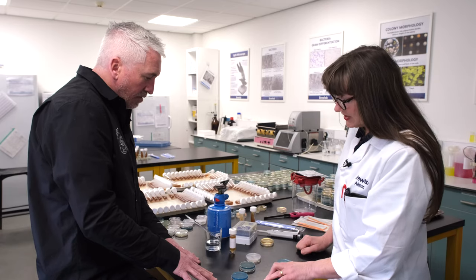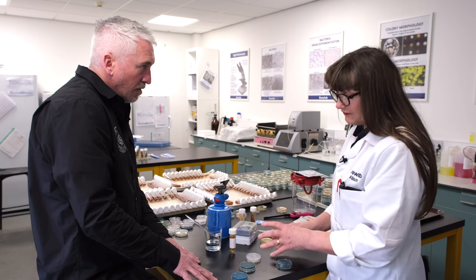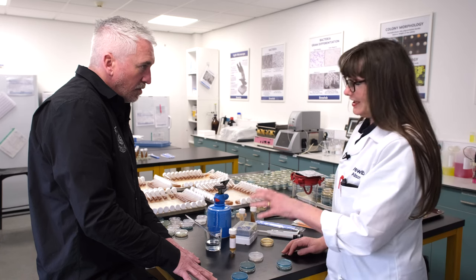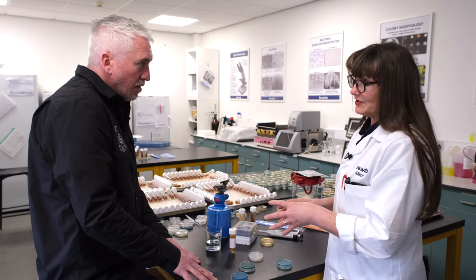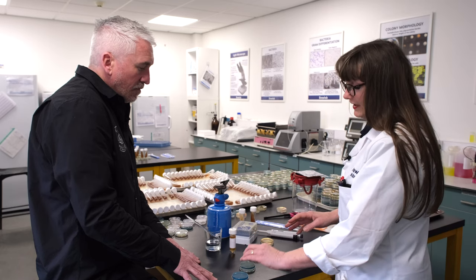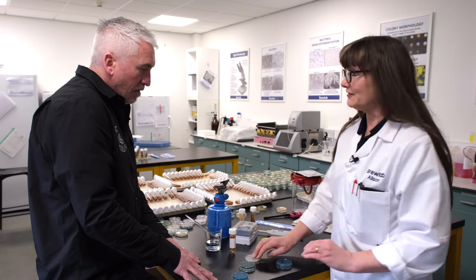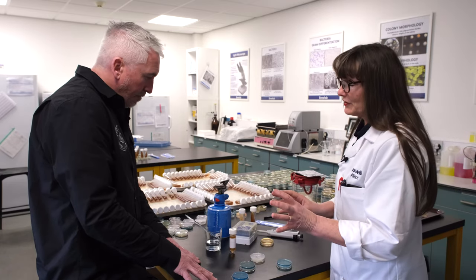Then we've got another media type called lysine agar. It's a different nutrient that inhibits brewing yeast and just allows non-Saccharomyces wild type yeast to grow. Not all wild type yeasts would grow on the copper plate and the lysine plate, so we put another one in there to try and capture any wild type yeast that might be present.